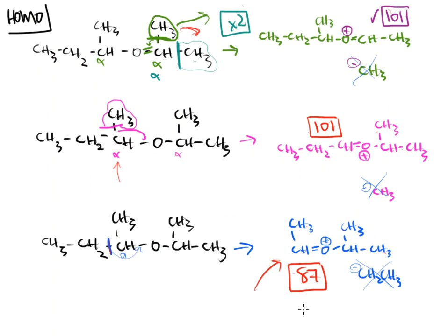It's really due to the fragmentation pattern. The molecule, how is it going to break apart? What is the best way for it to do that? Heterolytic cleavage, we said oxygen typically goes with the bigger fragment, right? But at no time did we say that's what homolytic cleavage does, because this 87 is higher, but the 87 is not the bigger fragment.